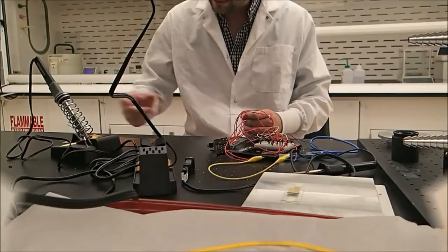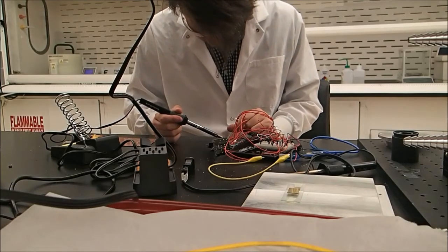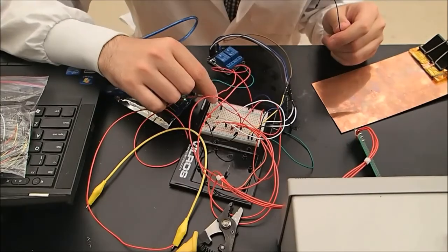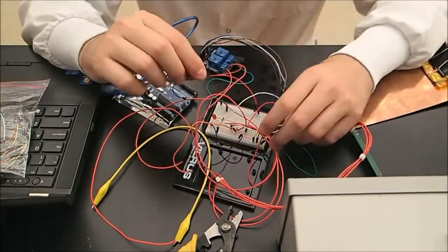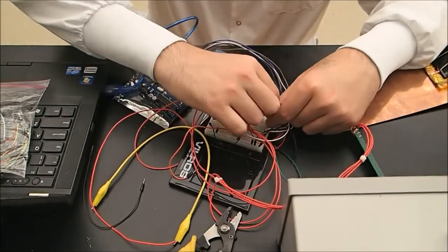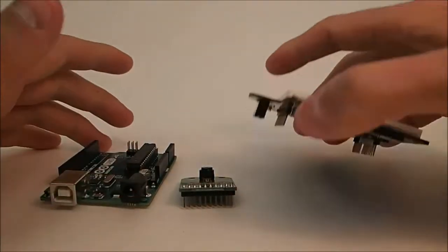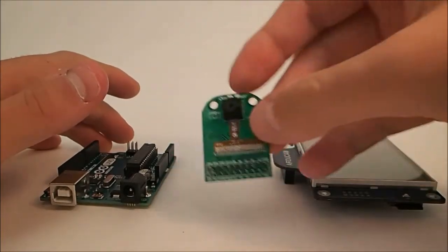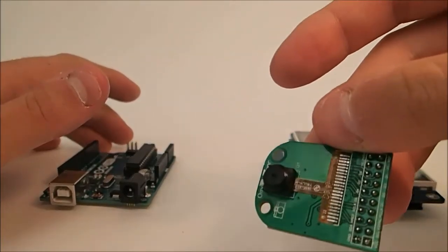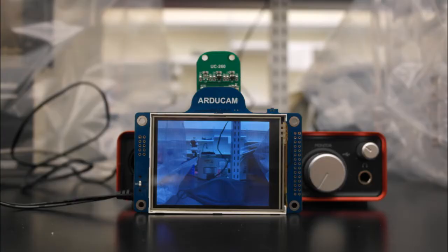At the start of the semester, we were shown some enclosure designs with the idea of a cell phone attachment, and expanded on the ideas in order to automate the test, removing user error. We aimed to place a heated copper plate in a 3D printed box, with placeholders to secure ELISA testing cups. Instead of a cell phone camera taking the pictures, we purchased a camera for an Arduino microcontroller that would be mounted in the roof of the enclosure. The camera is manually operated, but with continued research efforts, there are possibilities for automated picture capabilities.